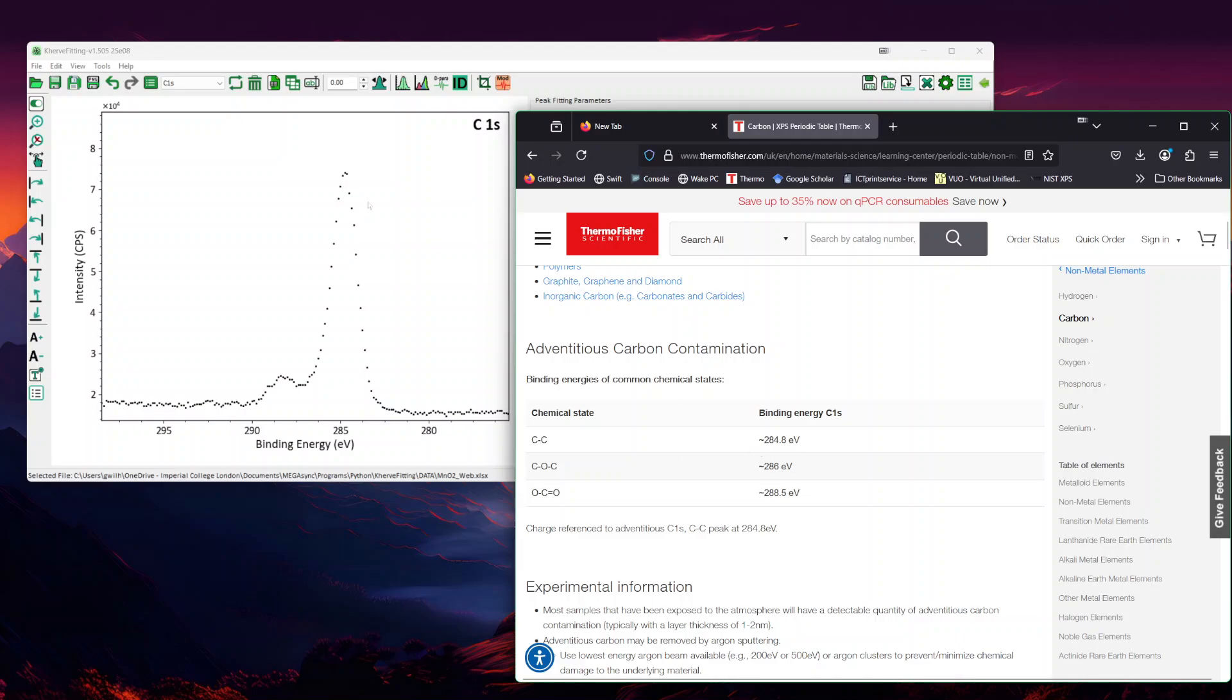I can see that I would be looking mainly around three species. The C-C at 284, I'm getting that. Then the O-C double bond around 288.5, maybe it's around there. And then something maybe around 286. That looks maybe slightly asymmetric, so maybe that's because there is a peak.